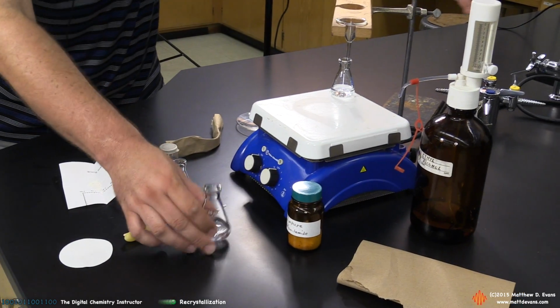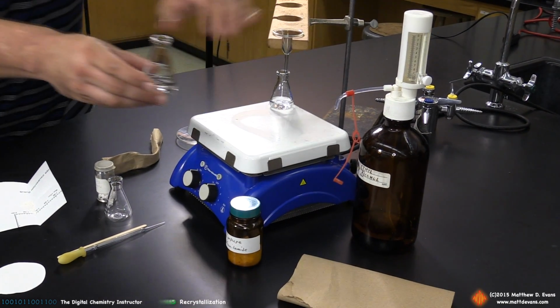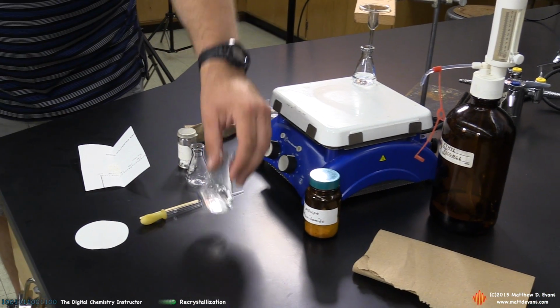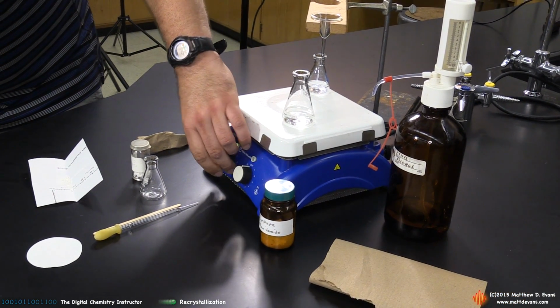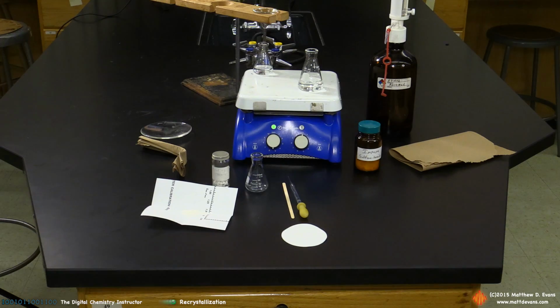The way the pump bottle works is you just simply hold the flask underneath the spigot and pull this up and push it down, and a little bit squirts out at a time. We only need about 20 milliliters to complete this experiment. So I'm going to get this solvent reservoir, which we're going to use to recrystallize, on the hot plate and get that heating as soon as possible. I'm going to turn it up to about 5 to get it boiling in a hurry, and then I'm going to scale it back once it gets boiling.